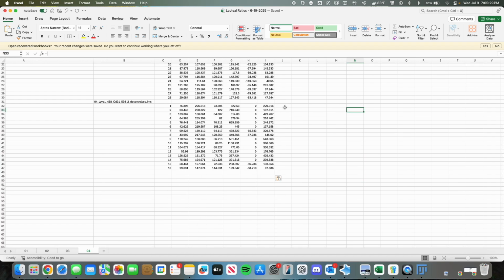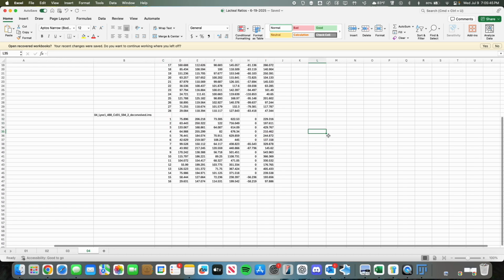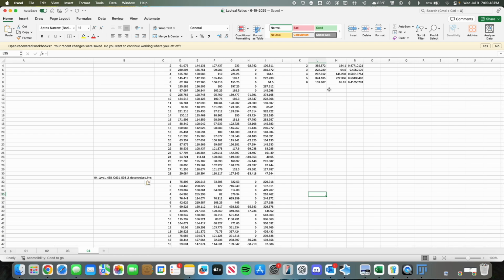So remember how we did the villus ratios, by alternating every one. So these first two would be one ratio when we go to do it. And for longer lists, you can resort to using external software such as ChatGPT, or finding any other way to get every other to be set up. I haven't found a suitable way in Excel to get that to work. But if you do find one, then go ahead and do that.